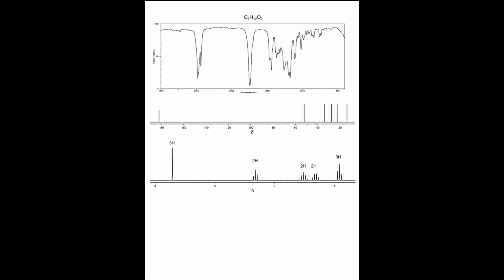So this video is in case you needed a refresher on how to solve spectroscopy. I'm just going to do two problems here, which I'll post on Moodle so that you have the hard copy. The first thing that you're going to get with your unknown experiment is the spectra with a formula. You'll have IR, carbon NMR, and proton NMR as well. And your job is to solve the structure using these three pieces of information, just like we did in 225.